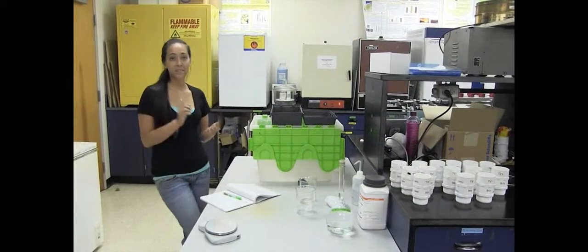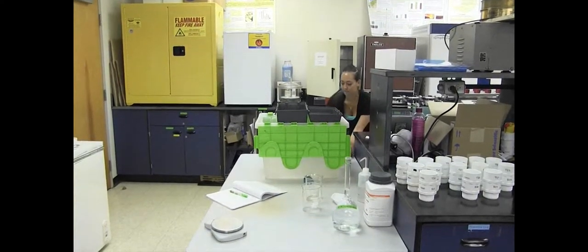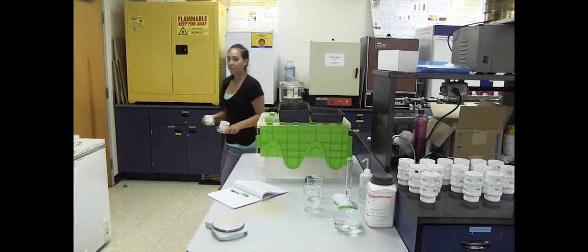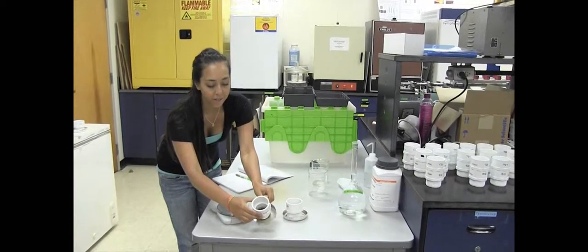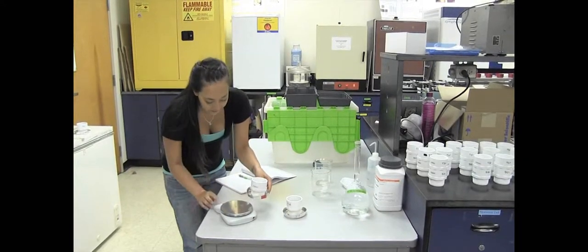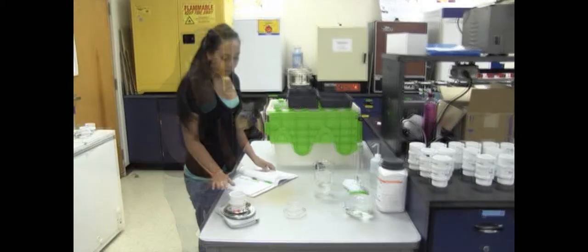Now that it's been 24 hours, our soil that we put in the oven should be dry. This is what they look like after they're dry — see the 53 micrometer one and the 250 micrometer sieve. On our field scale, weigh and record the weight of the dried soil, the sieve, and our tin.